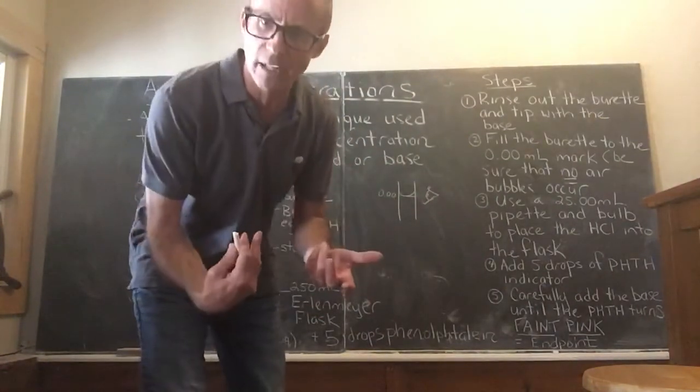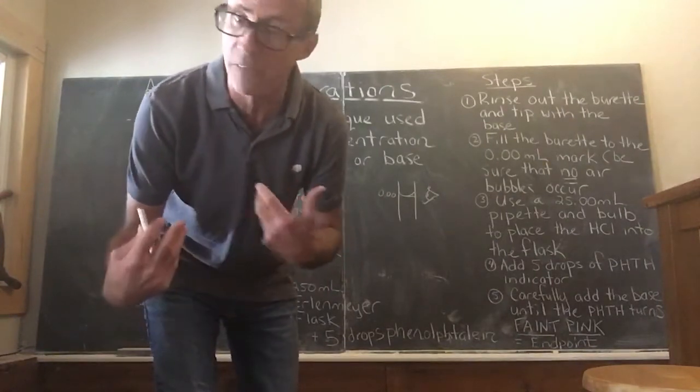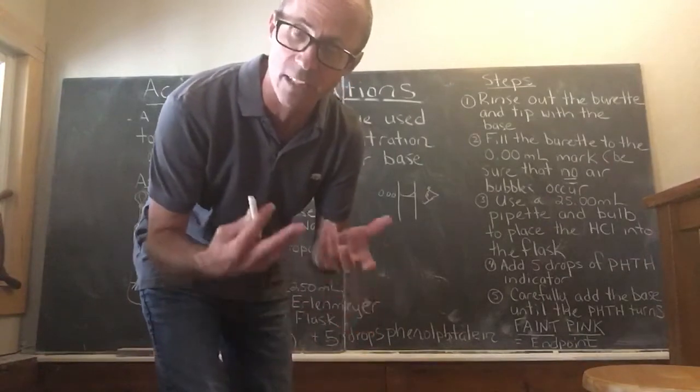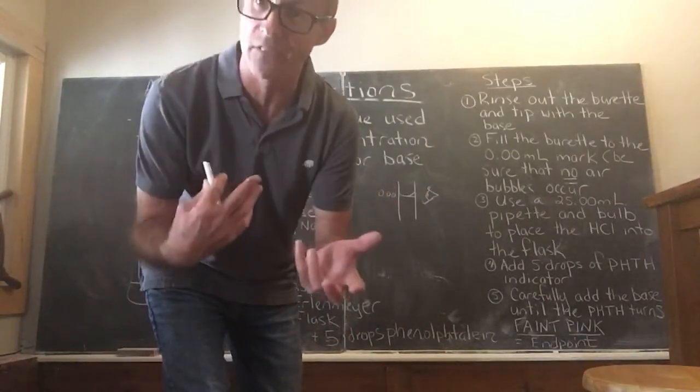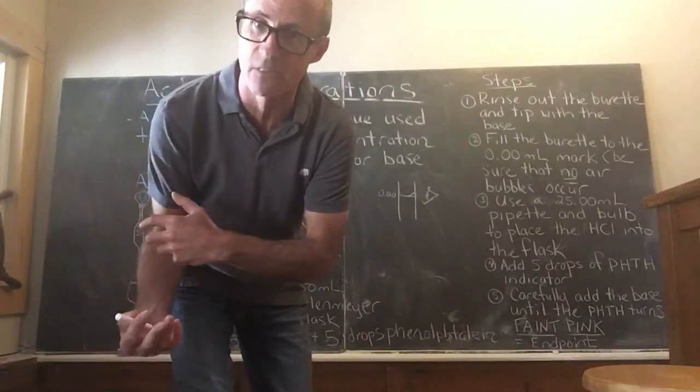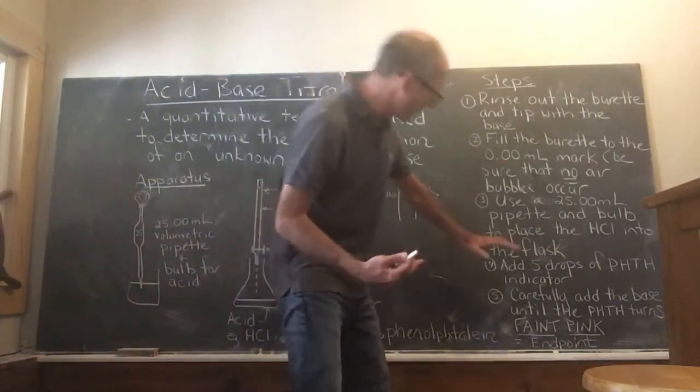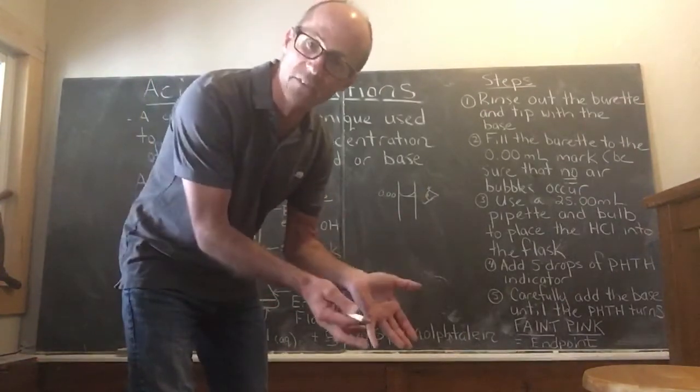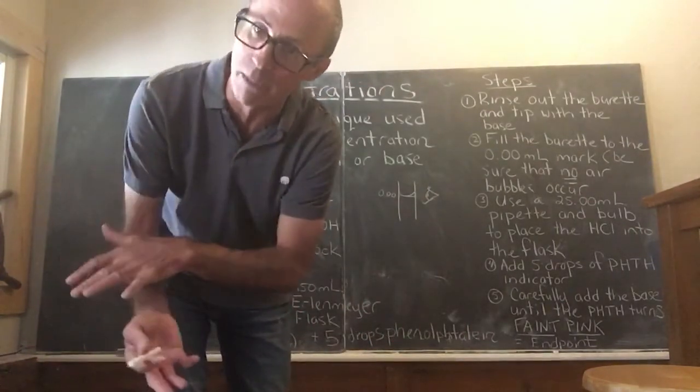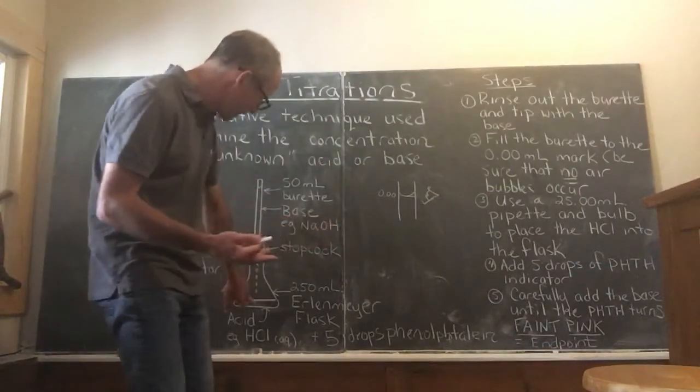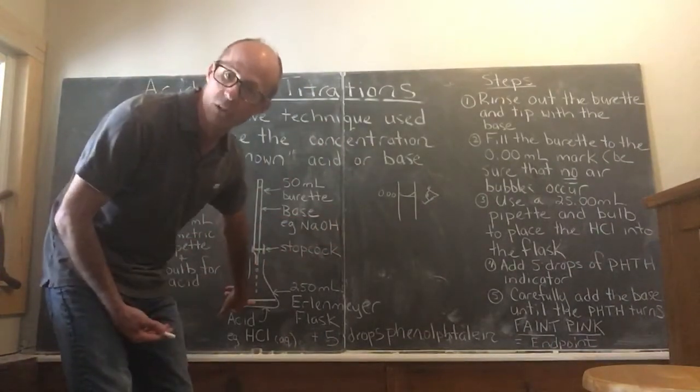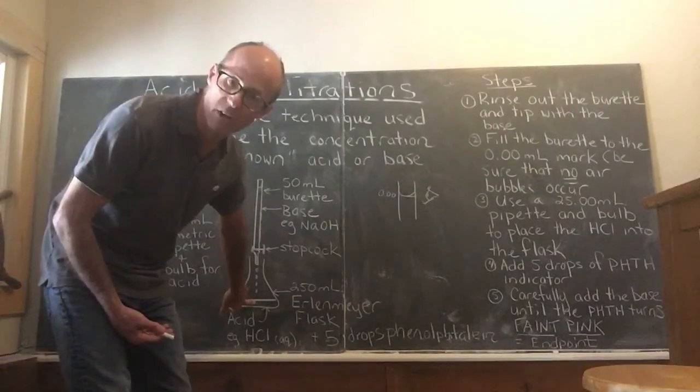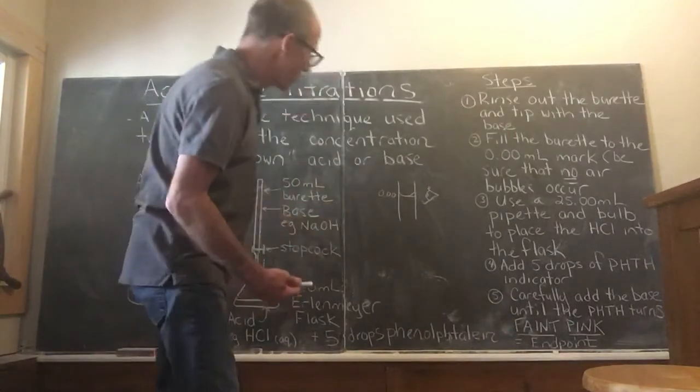If you don't do the next step, it will appear like you're adding water to water and nothing will happen - never a good thing. We need the indicator to indicate when the acid in the flask has been completely neutralized by the base in the burette. That indicator, like I said moments ago, is phenolphthalein. Remember, it's clear in acid and it's pink in base. So when you put it into your acid, you won't see it. We usually put five drops of phenolphthalein in there - six, seven, doesn't matter, as long as you have at least five.